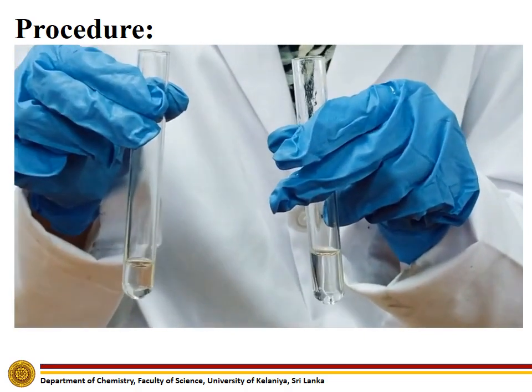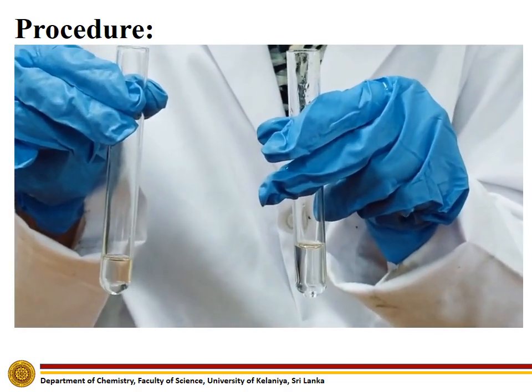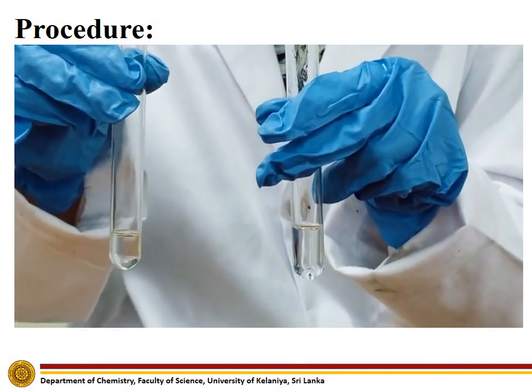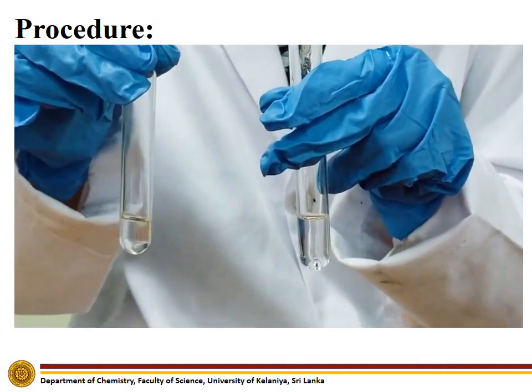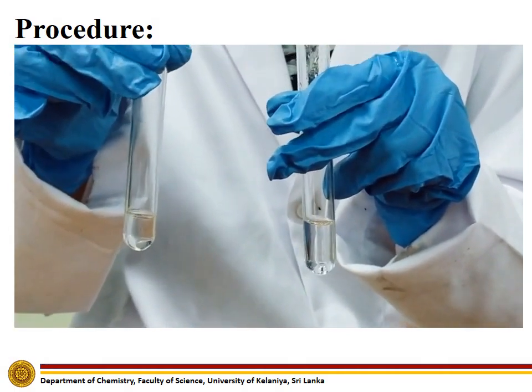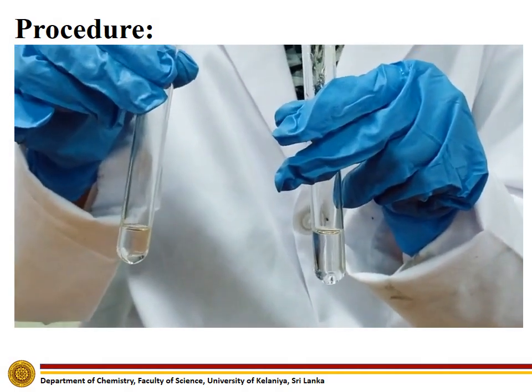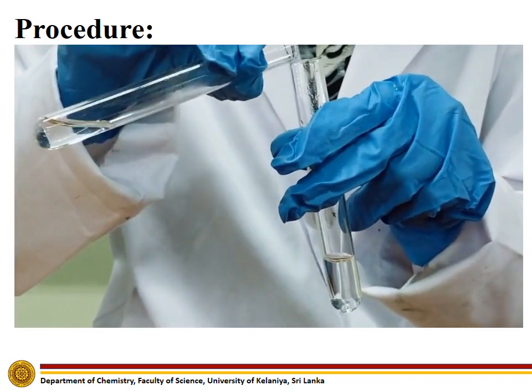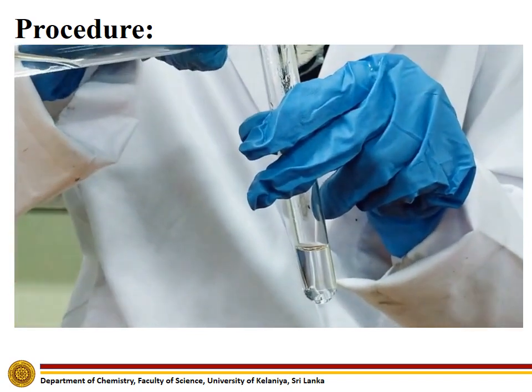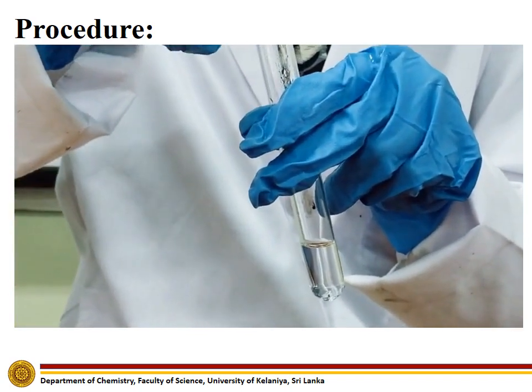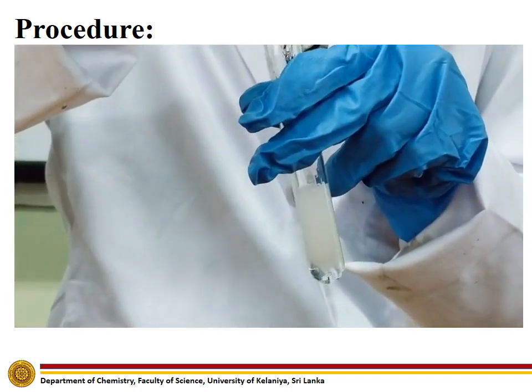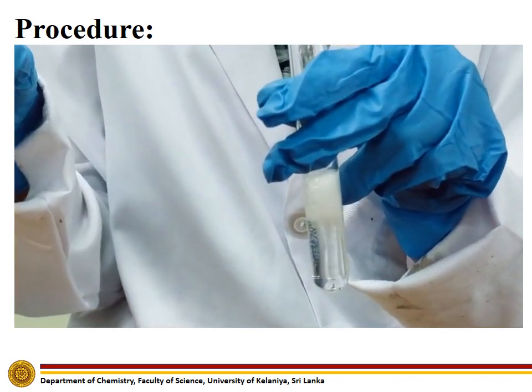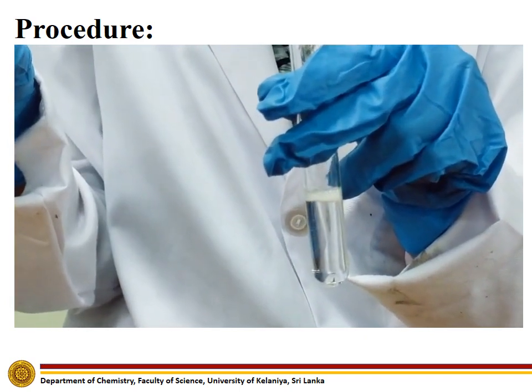To carry out the third experiment, add to a solution of sodium carbonate and observe the evolution of gas bubbles. Evolution of gas bubbles was observed.